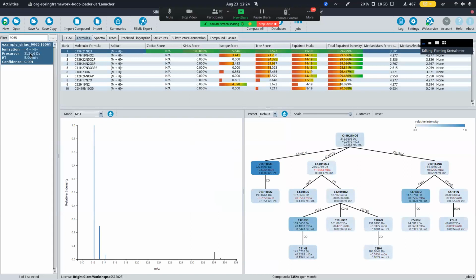Okay, let's just go through these views. It is not important that everybody has exactly the same example. I'm going to show a few things, but if you have some other computations that were finished, you can also click on them and go through the views.